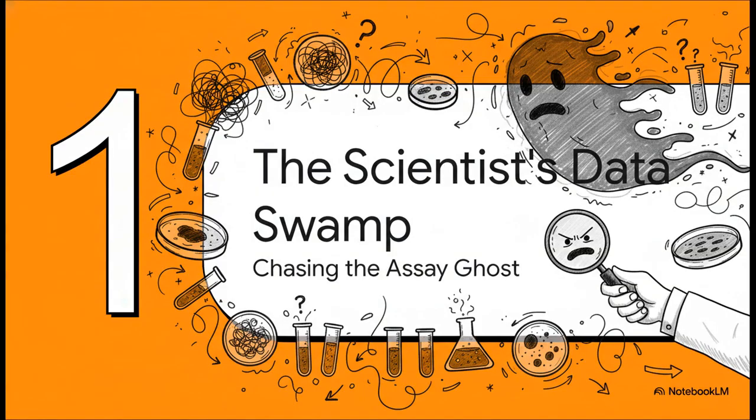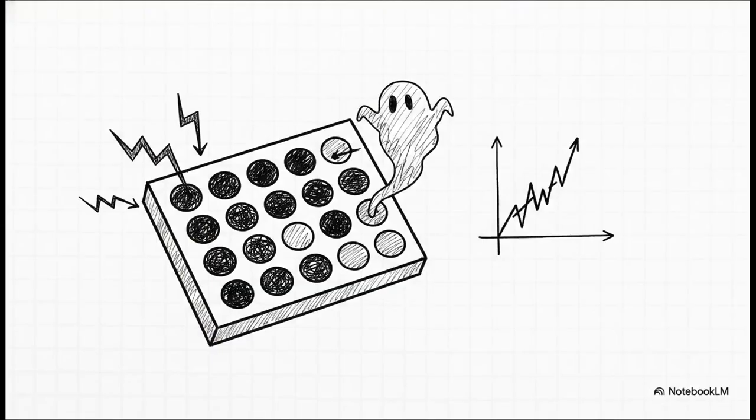So, to make this all real, let's dive into a frustrating, and I'm sure all too common, lab nightmare. We're gonna go chase a ghost in the machine, the dreaded assay failure. Okay, imagine this. You're developing a really high-sensitivity ELISA, but nothing is working. The background signal is through the roof. Your controls are drifting all over the place. Your standard curve is basically useless. So what is it? Is it the blocking buffer? Maybe the wash steps? It really feels like there's a ghost in the machine, and we are going to design an experiment to find it.